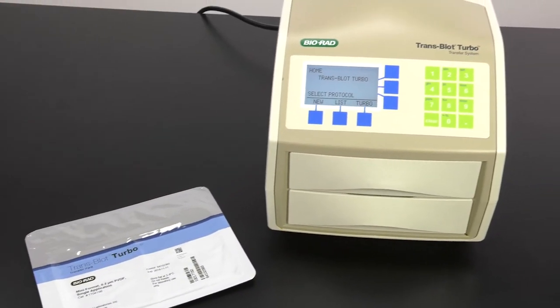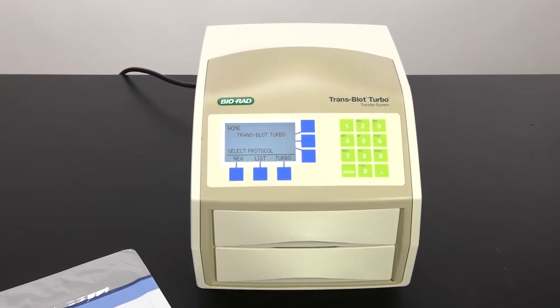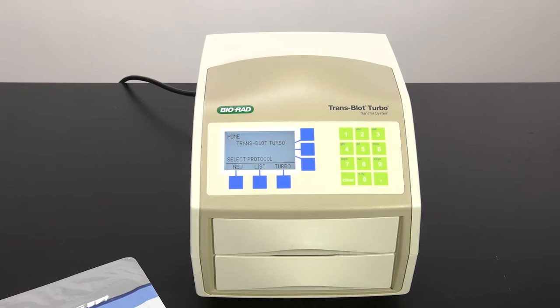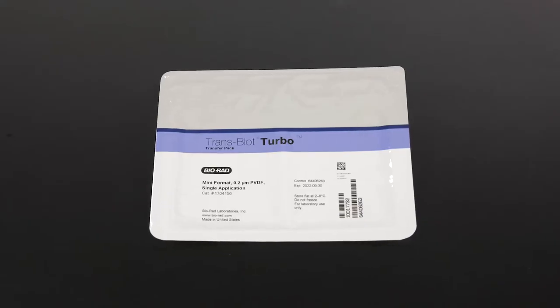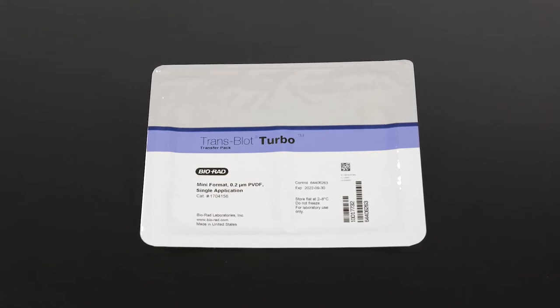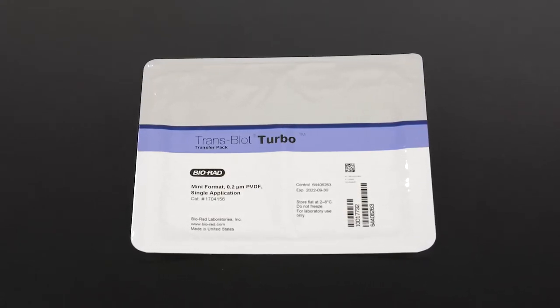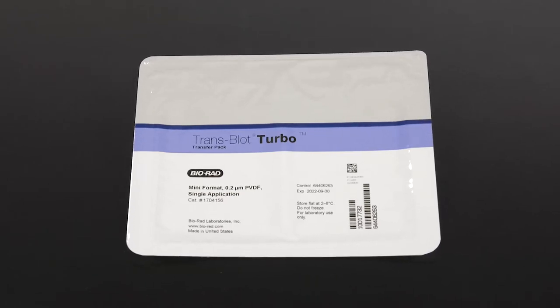In this video, we will show you how to assemble the transfer stack for Western Transfer using a Trans-Blot Turbo transfer system. The Trans-Blot Turbo system is compatible with standard transfer materials. However, today, we will demonstrate the use of Trans-Blot Turbo transfer packs for rapid transfer.